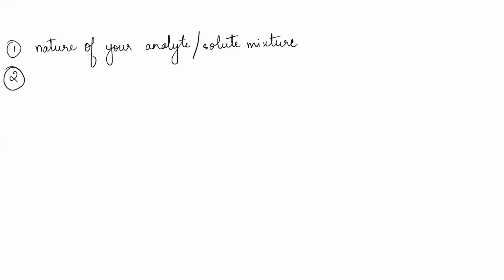Just like you decide to wear a dress depending upon the function that you are attending. If you're going for a wedding, you're going to be dressed appropriate for a wedding, and similarly for other events also. Similarly, depending upon the solute mixture, the stationary phase will be chosen.